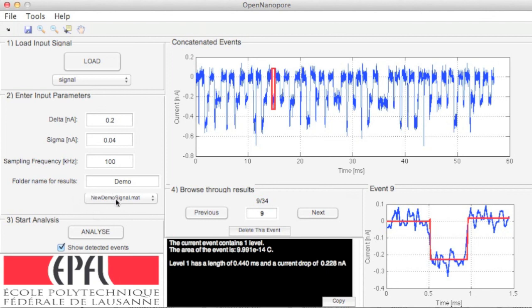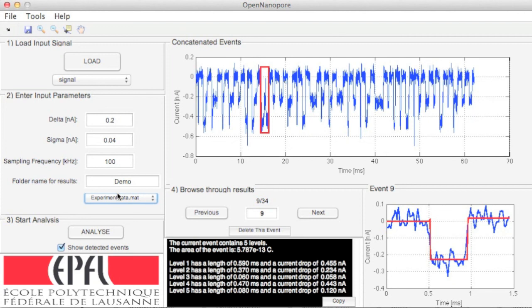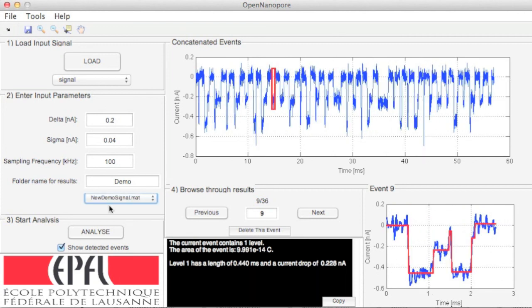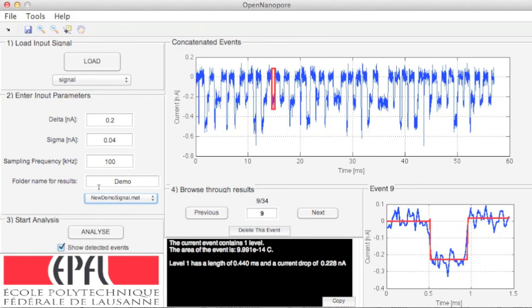You can change between databases using the drop-down menu. Thank you for using OpenNanoPore software.